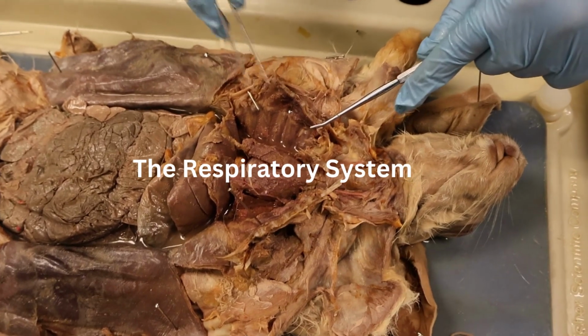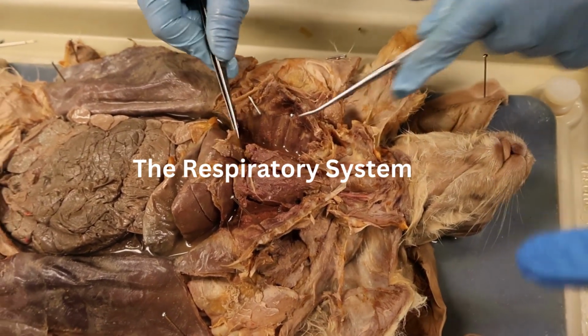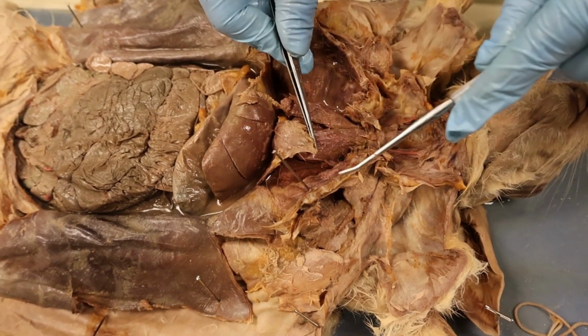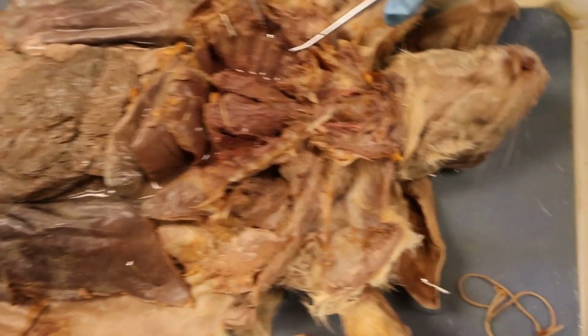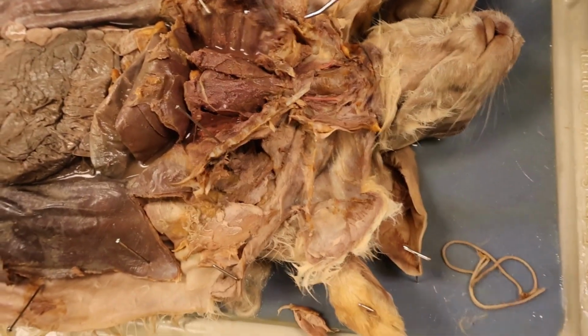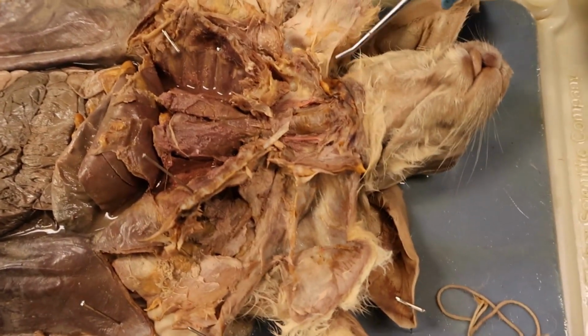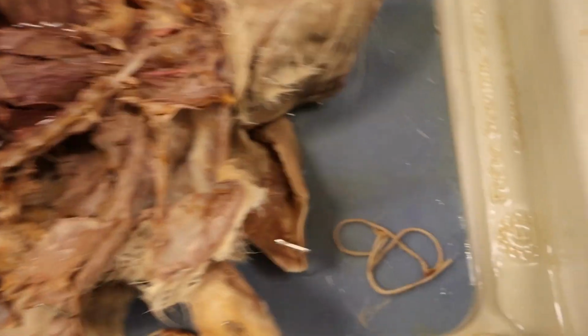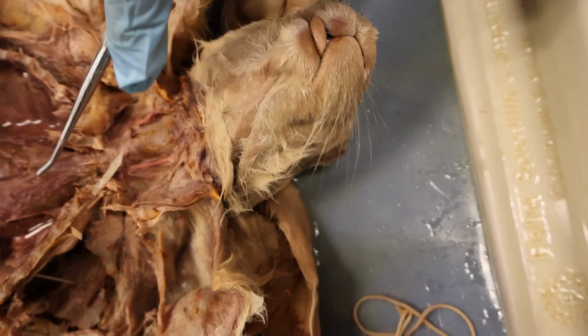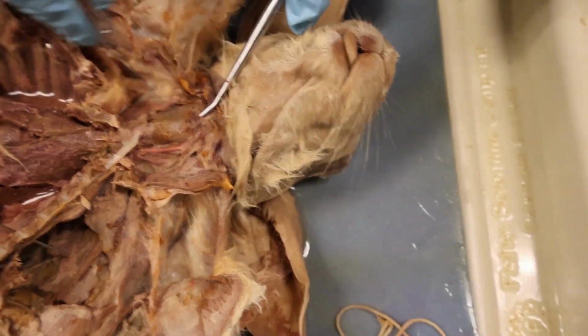So this is going to be the respiratory system. We have the diaphragm, which is the thin muscle that controls breathing in mammals. Right next to it is the rib cage, which is part of the skeletal system. This protects the lungs and the heart in mammals. Right underneath it, as shown here, are the lungs. And then we have the trachea right over here.